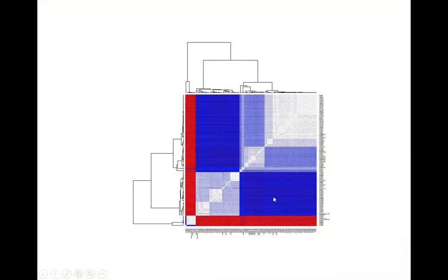Another way to look at SNP differences is by these massive similarity matrices as shown here. Now, they might be used by some epidemiologists and labs as they communicate with each other and might not be used by others, but I think they illustrate a relevant and important concept.